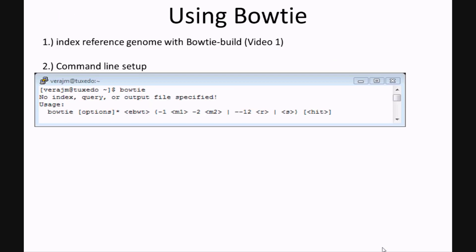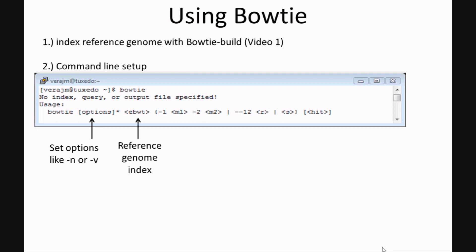Now we're ready to run Bowtie. Remember, first you have to index the reference genome using Bowtie-build. Here I'm showing an example of the Bowtie usage statement. First, you have to set all of your options — for instance, either -n or -v, and any of the other alignment options that we discussed. This is followed by the reference genome index name that you set using Bowtie-build.